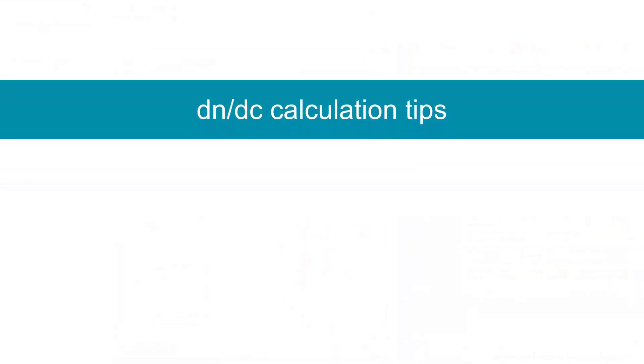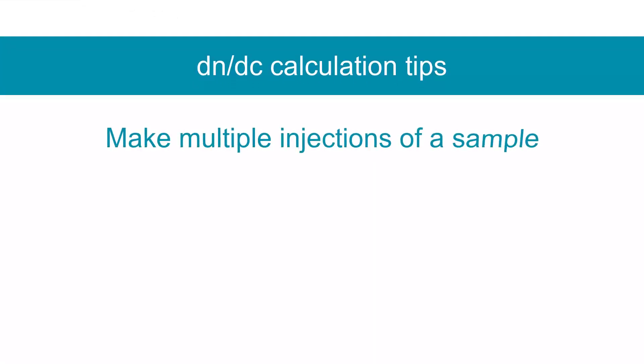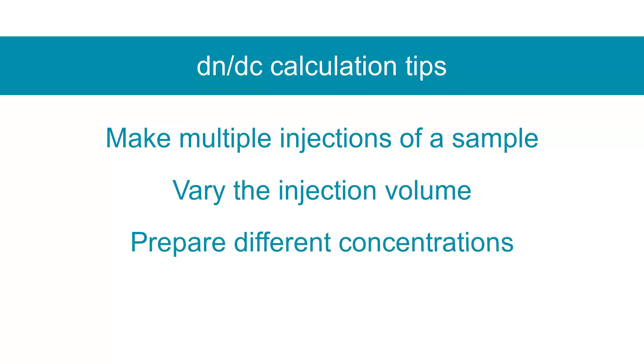It is recommended to make multiple injections of a sample when calculating its DNDC value. Varying the injection volume or preparing the sample at different concentrations will help ensure your final value is accurate.